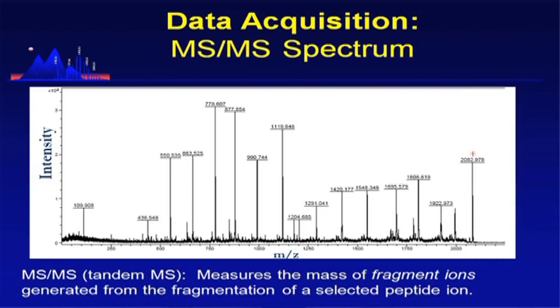So it's the same idea that we can predict the tryptic peptides. Now we have a fingerprint because we know where they should fragment, right, when we digest with trypsin. So now we have a fingerprint of peptides for that protein. It's the same with our fragmentation in the mass spec. We have a peptide, we know where it should fragment, and now we experimentally have a fragmentation pattern, so we can predict and we can match them up.